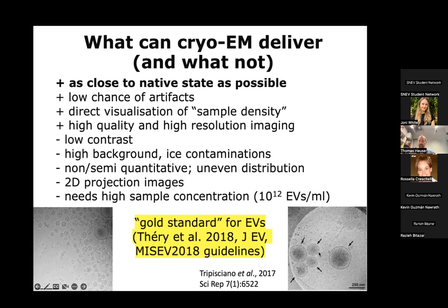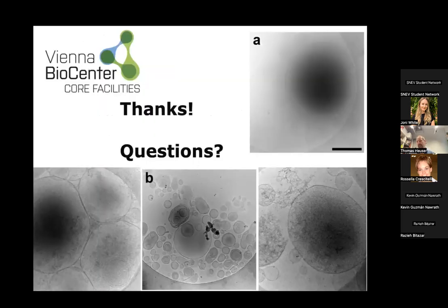And as I mentioned now, I want to close by pointing out cryo-EM is not perfect. There's still a few things you need to keep in mind, but this is considered the gold standard, the best you can do if you want to visualize EVs right now.